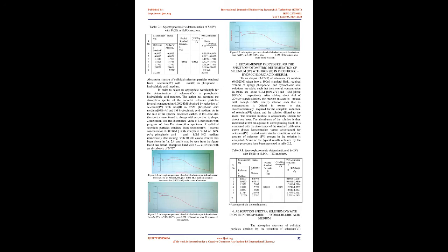From this, a 0.02 M and a 0.0025 M solution have also been prepared by suitable dilution, to be utilized in the preparation of synthetic mixtures and in the spectrophotometric determinations respectively.